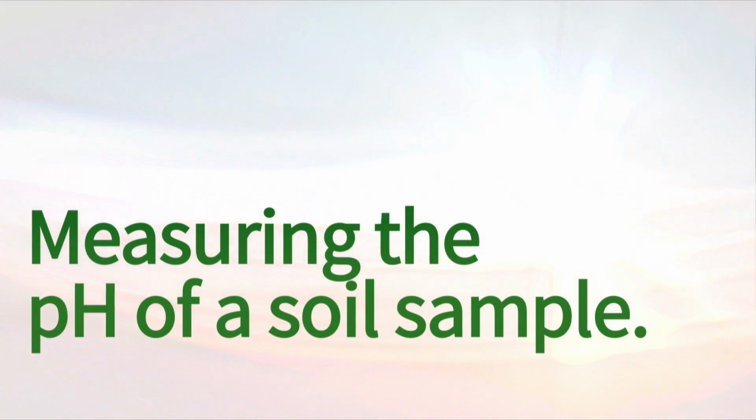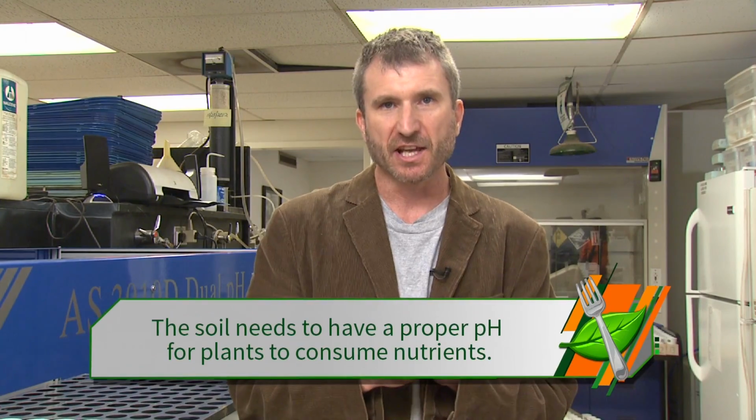For plants to be able to consume nutrients from the soil, a number of chemical reactions have to take place. And so the soil must be right to facilitate those chemical reactions. It has to have the right environment. And one way of measuring a good environment for plant production is the pH level of the soil.